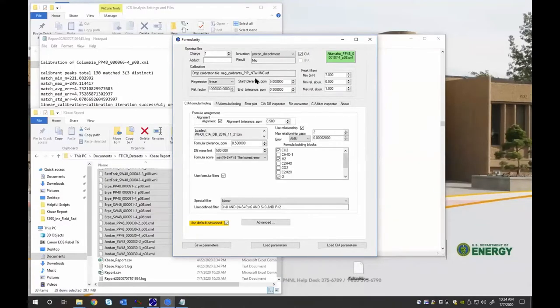I'm not sure whether or not we'll address that during the virtual tour, but that is something that WHONDRS tries to standardize to ensure that the data isn't hypervariable, is at least somewhat controlled, which is hard to do. I want to stress, it's hard to do with FTICR. So even with all our strides, it's not 100% successful, just decently successful.